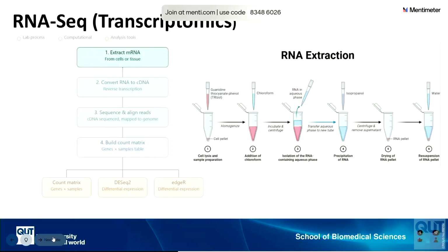Next, RNA sequencing. This one should look very familiar to you because we've done it a whole lot within the lab. So first step, extracting the RNA. That we didn't get you to do. RNA extraction is actually really painful to do, very easy to contaminate. RNA degrades from anything. Because it's not meant to last a long time, because your DNA is the main copy, and your RNA is like the copy of your DNA, so that gets used up a lot. So RNA extraction, actually quite painful.